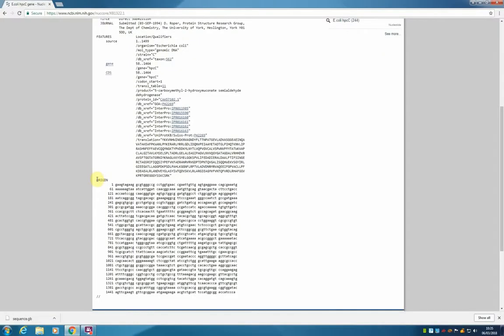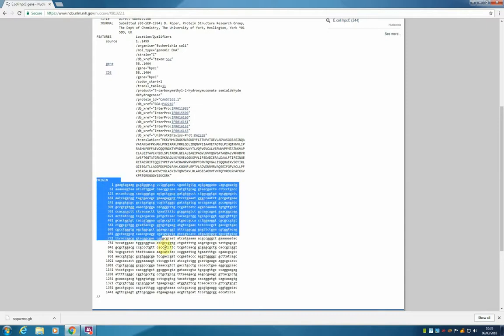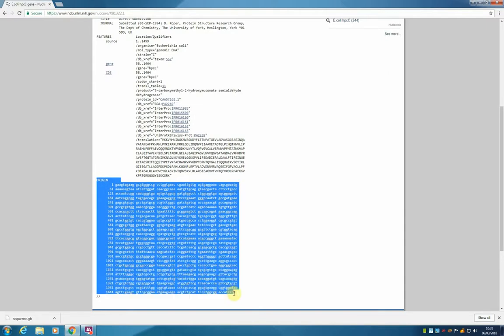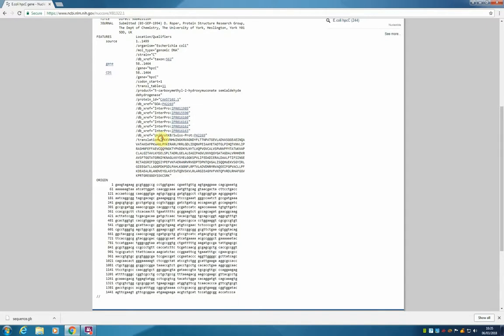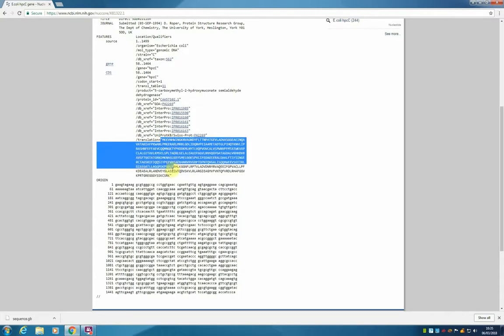At the bottom of the page we have the DNA sequence for this gene, we also have the protein sequence, which is the conceptual translation for this gene.